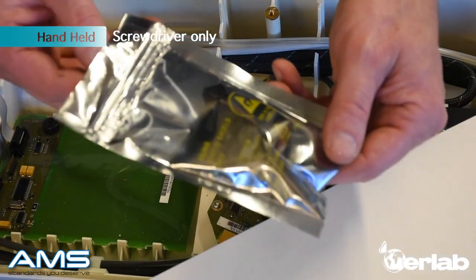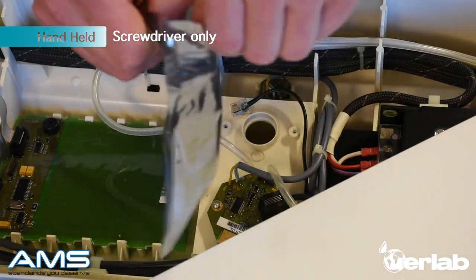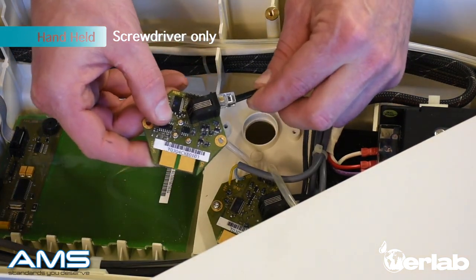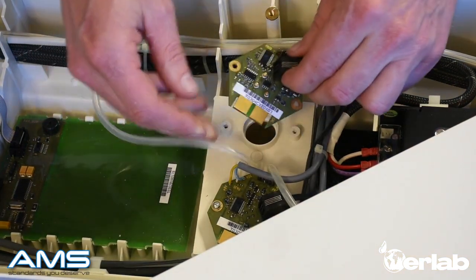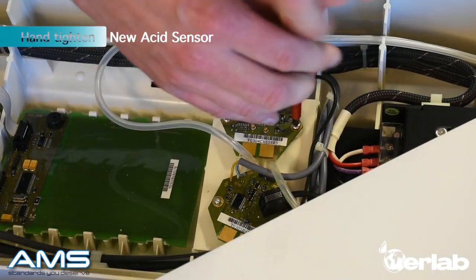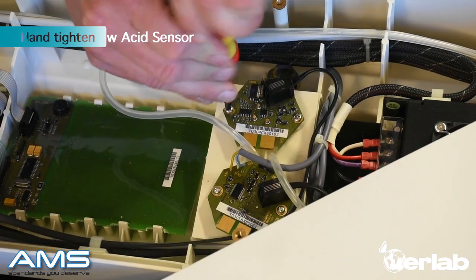Delicately take out your new acid sensor from the bag. Plug the connection back together and line up the holes for screwing them in. Take your handheld screwdriver and delicately tighten the screws into the sensor — do not over-tighten.